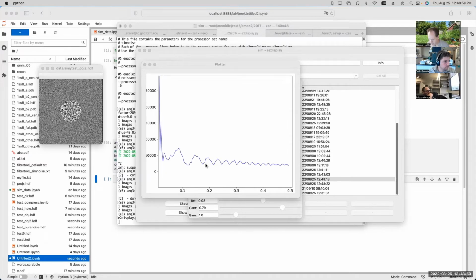Okay, now you can see the noise is up here, right? The zeros aren't going down to 0. The noise level is up here, but now you can see the CTF sitting clearly on top. So probably we want something in between those two extremes, right? So you might play with that with the filter tool. That would be one approach.